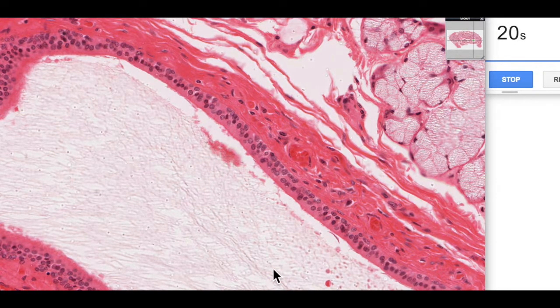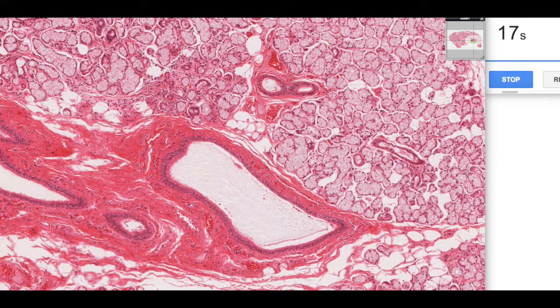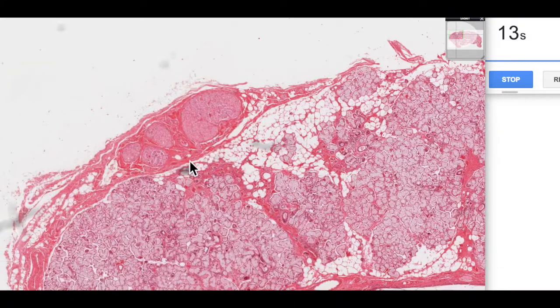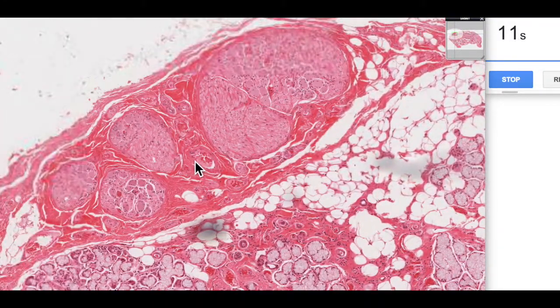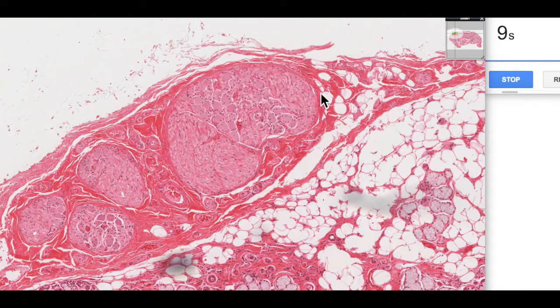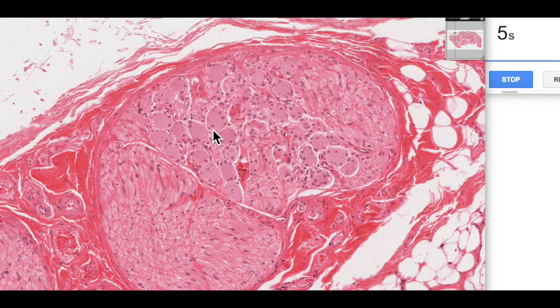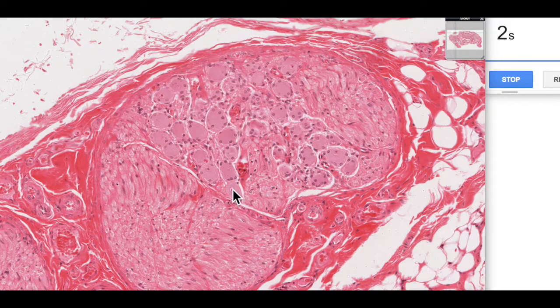You can see all this mucus secretion within this region. And just out of a little bit of interest here, if we go over to the left over here, we can actually see within the connective tissue capsule a ganglion. You can actually see these ganglion cells with their satellite cells, nice pale, big round nuclei, typical of a neuron.